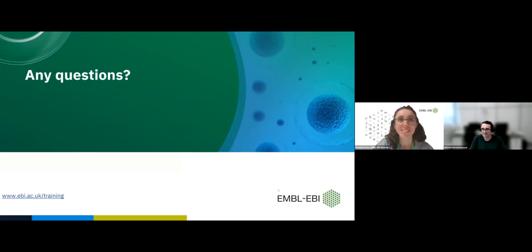Thank you. I would take actually another question. I think it's partially connected to your answer already, because another attendee is saying, if I run Napari on a compute server and want to visualize the results on my laptop, how can I do this effectively? I tried to use port forwarding, but as expected, it was quite slow. Is there any solution you recommend?